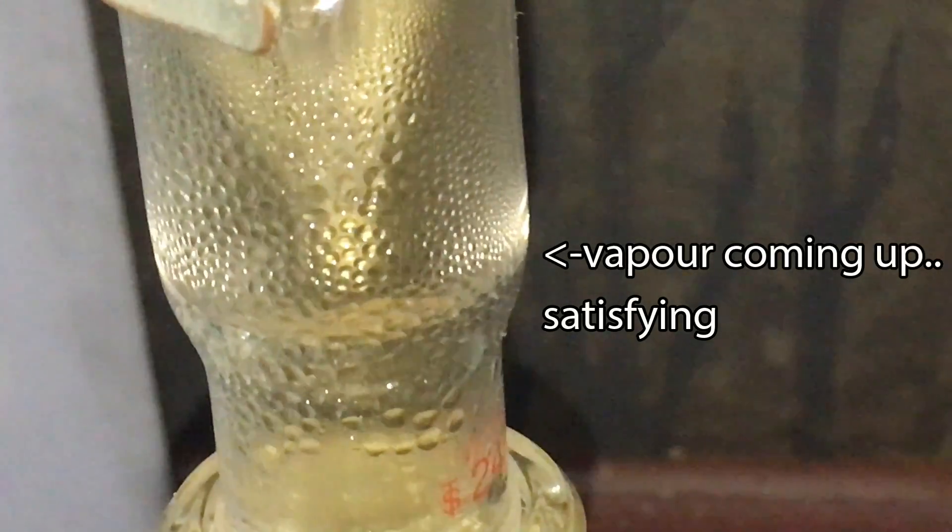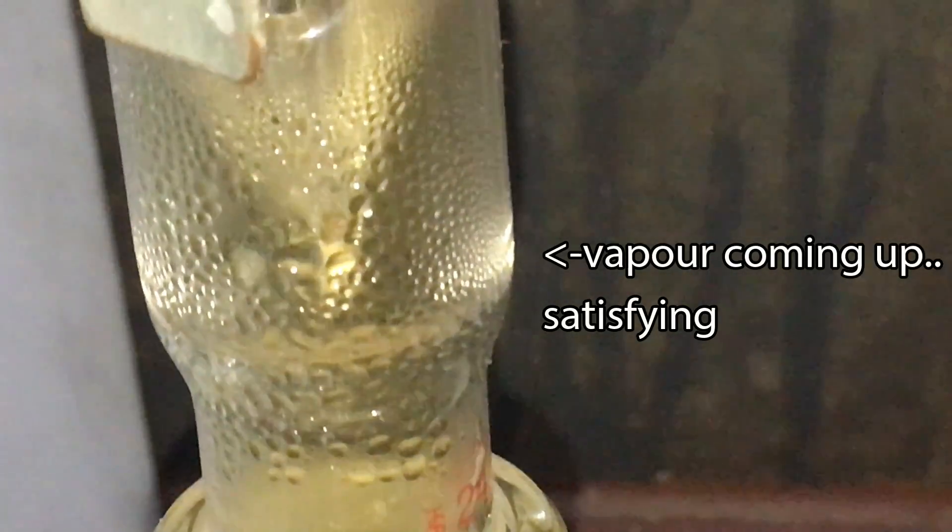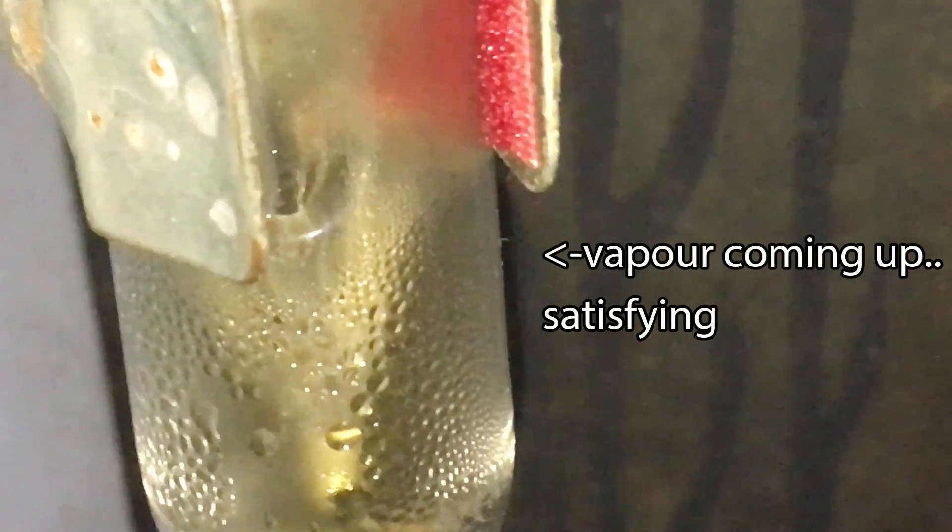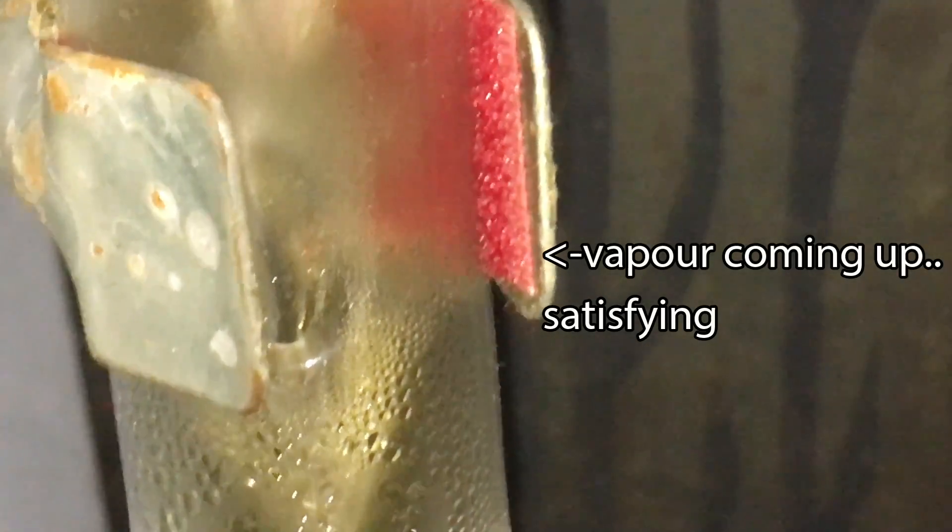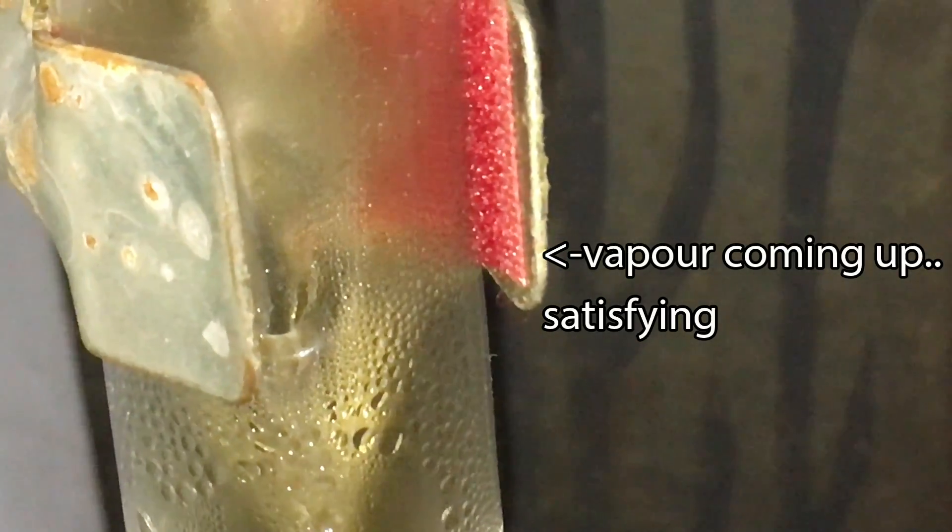As you can see, some yellow gas is formed. It is expected and is nitrogen dioxide gas. As toxic nitrogen dioxide gas is evolved, please perform this experiment inside a fume hood or in a well-ventilated area.